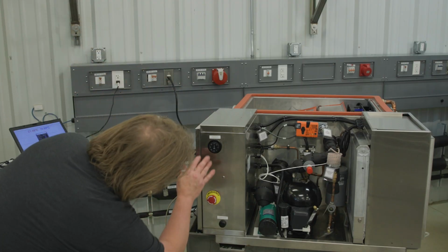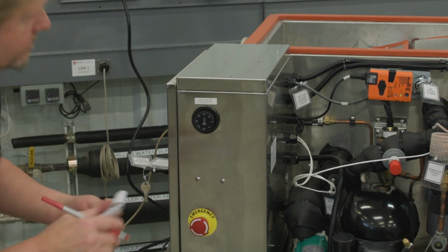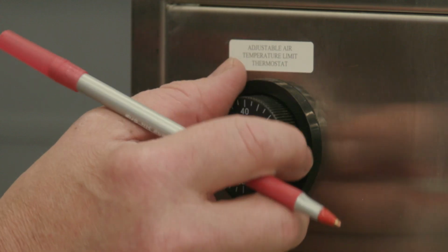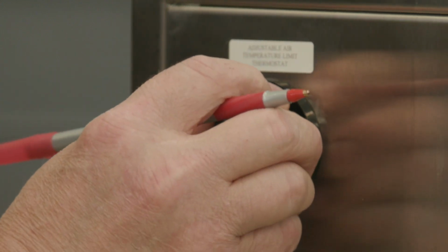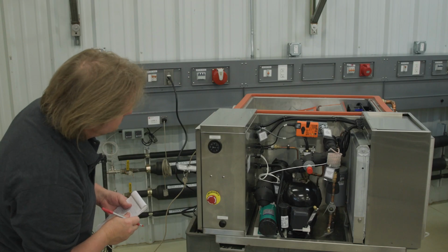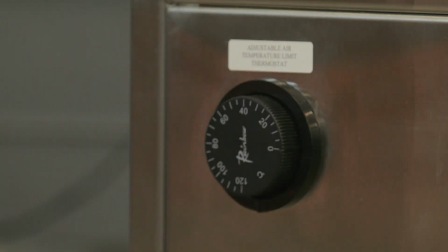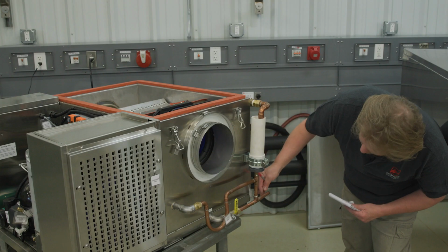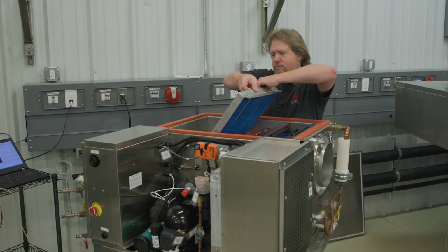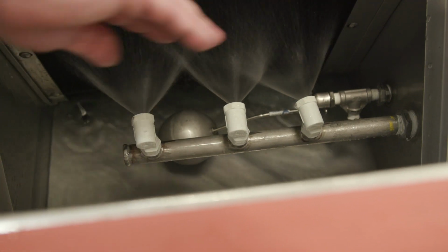Record the setting of the adjustable air temperature limit thermostat. Test the adjustable air temperature limit thermostat. Then, restore the dial to the previous setting. Next, confirm condensate valve functionality. And verify that the sump level is properly controlled by the water level control float valve.